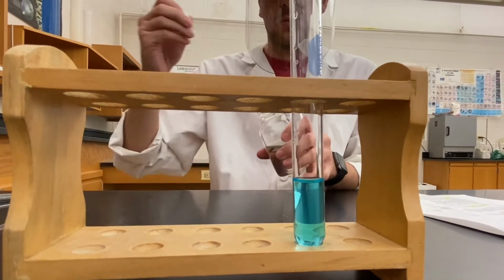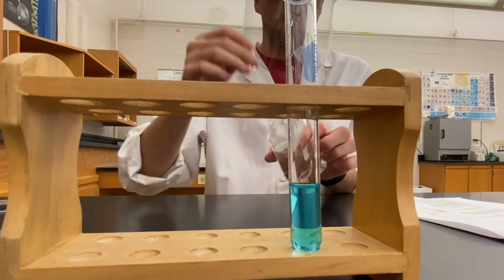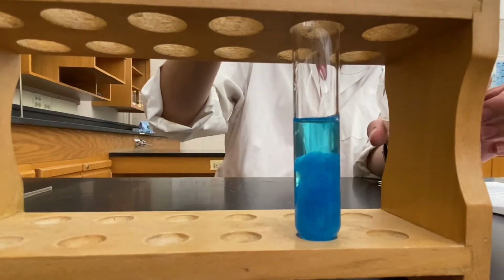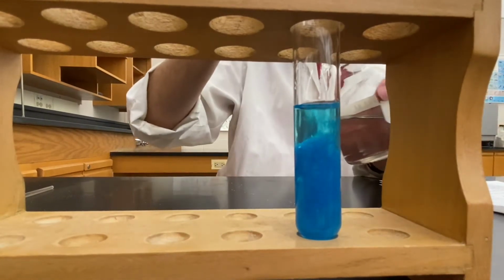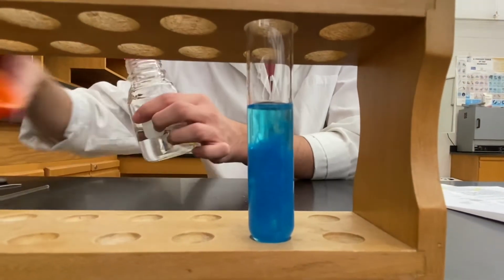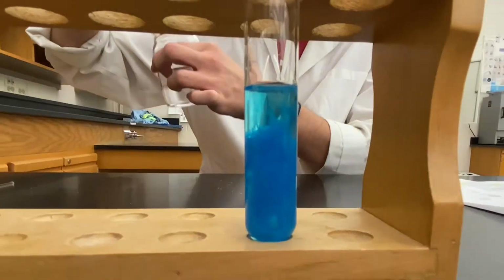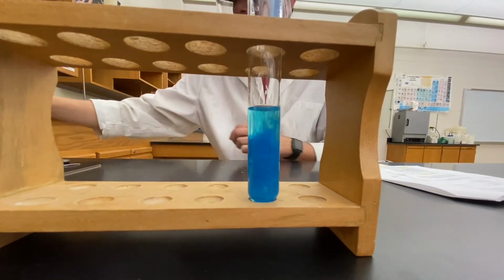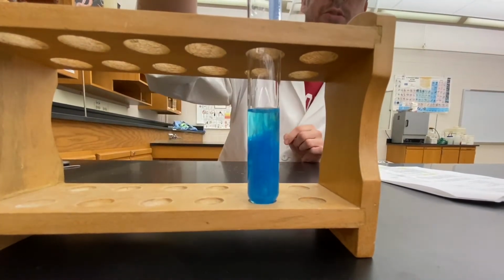With a pipette, maybe be a little neater. So I'll stir it with a stir rod.